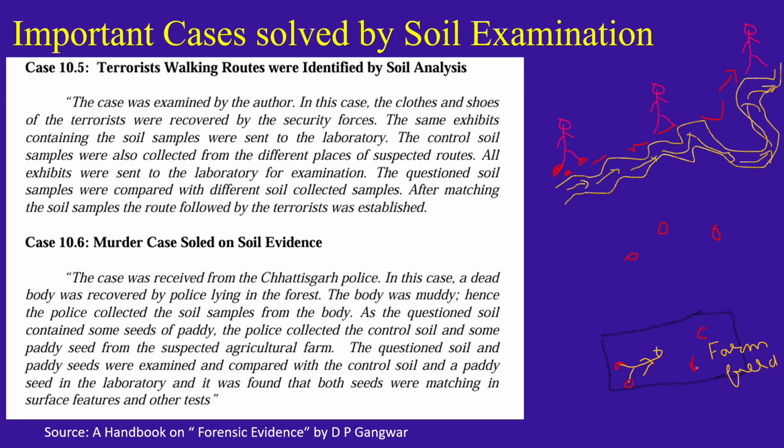In this case, besides the soil examination, we found some paddy seeds present in the questioned sample as well as the control sample. So for the first time in my life, I examined paddy seeds also, for the comparison of the soil samples.